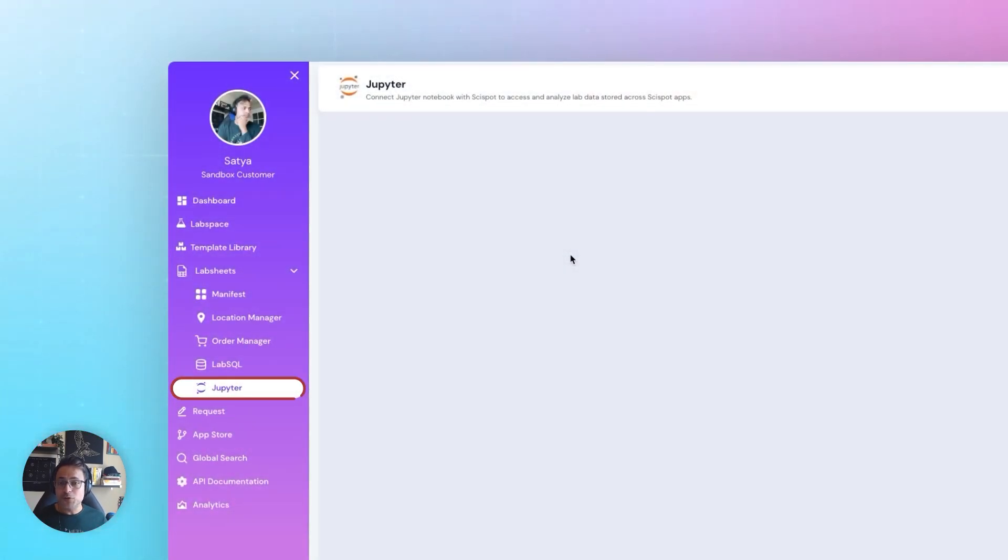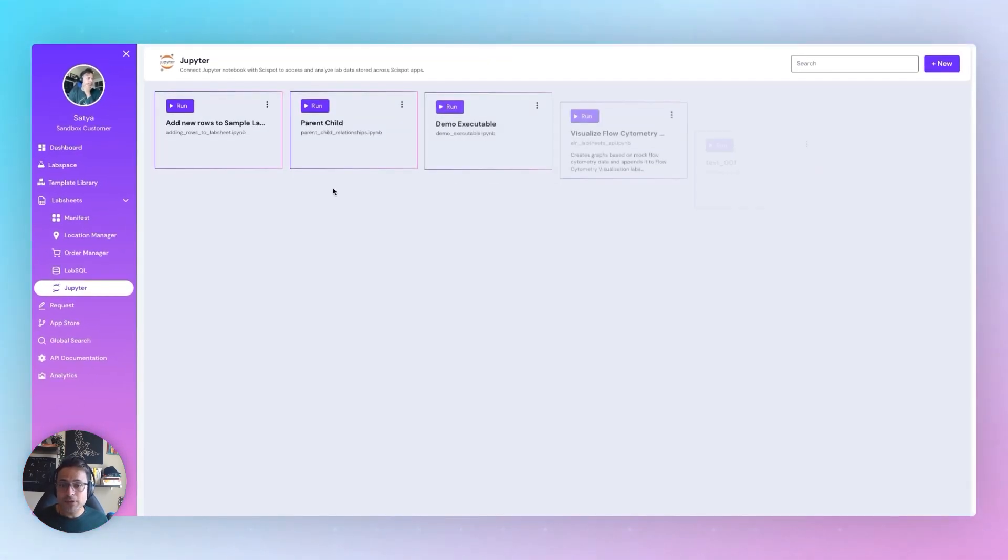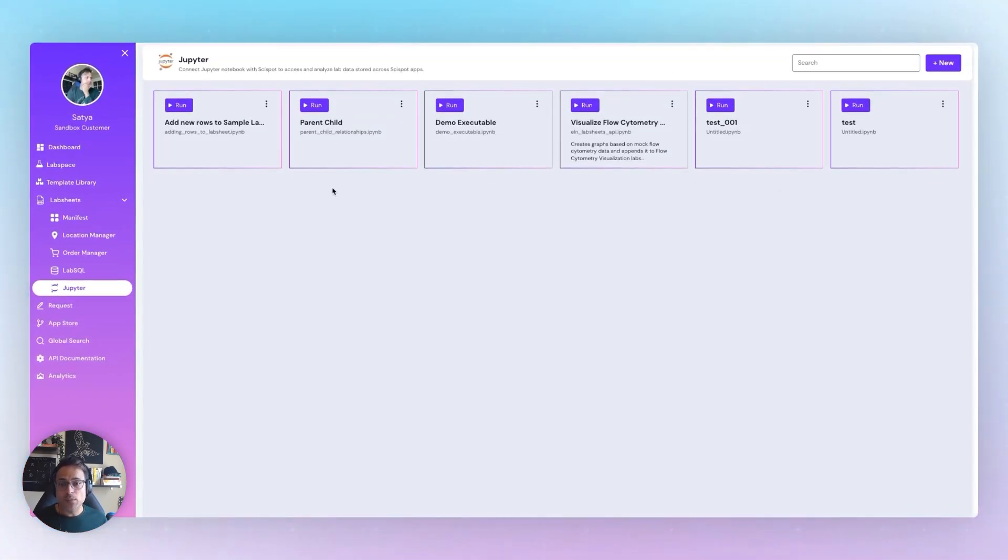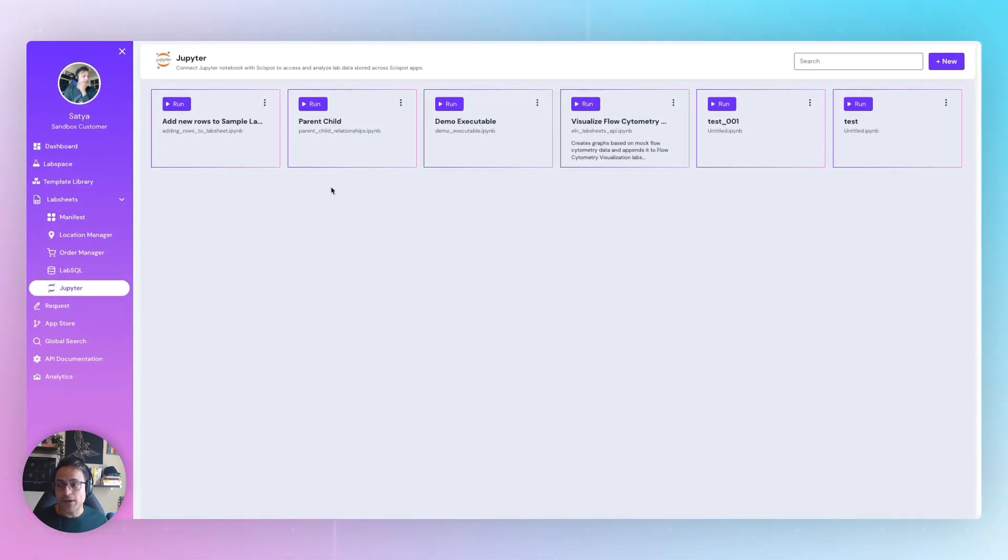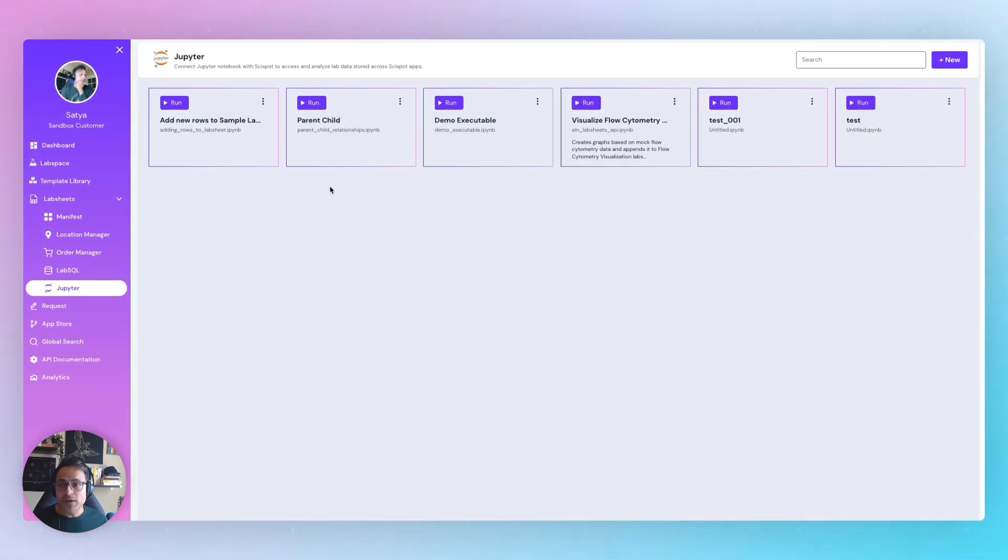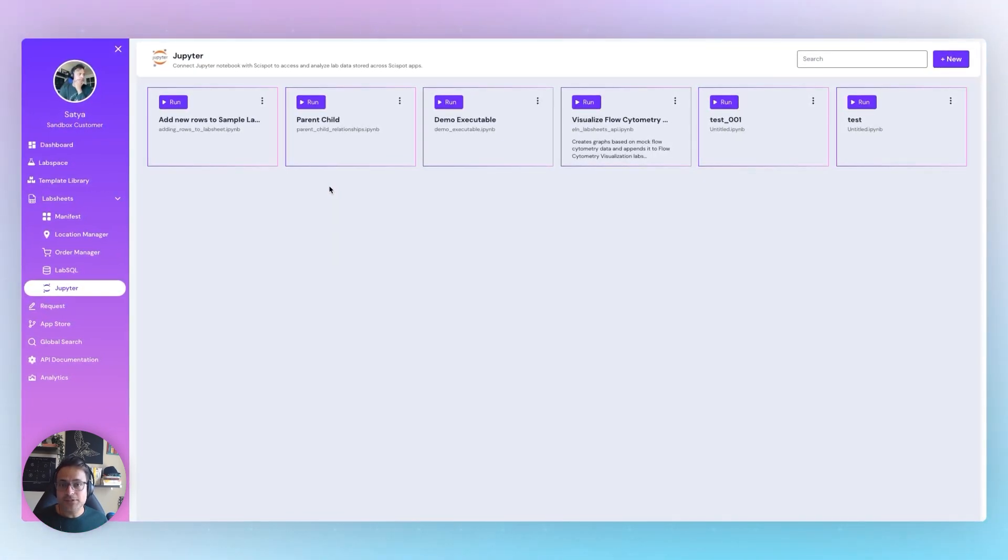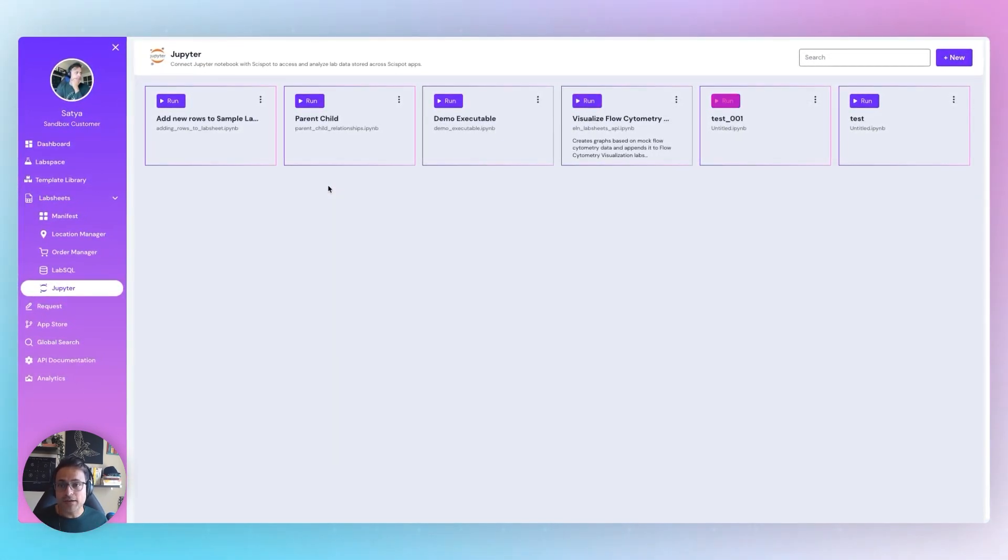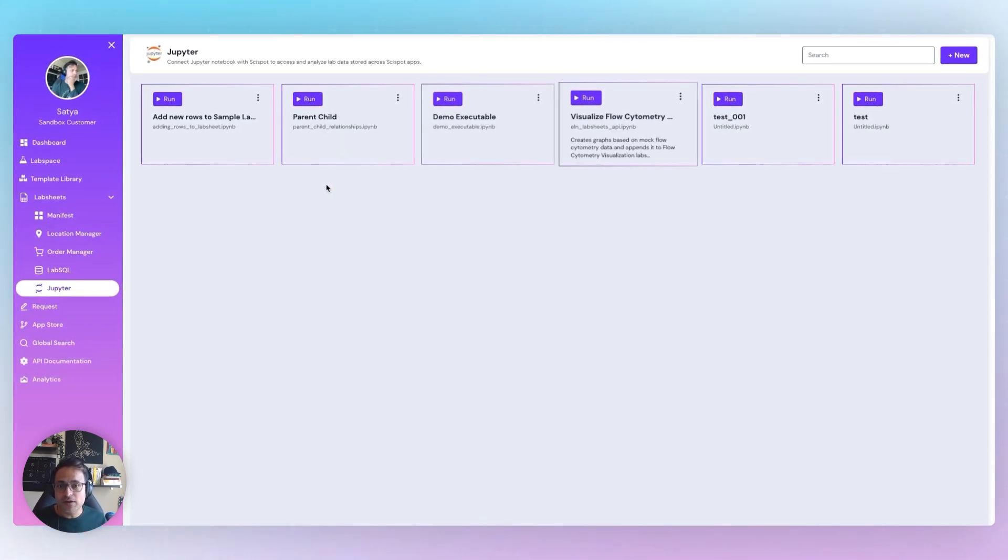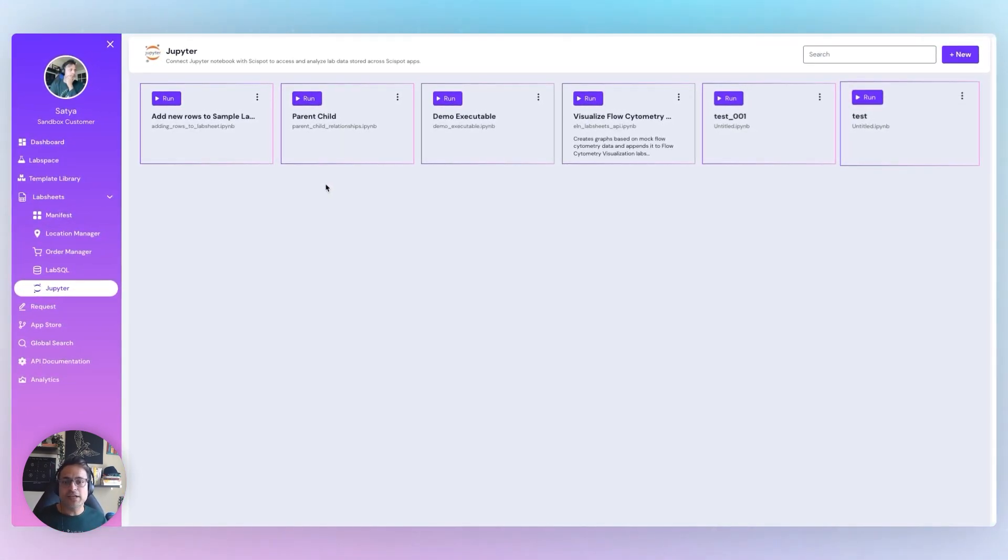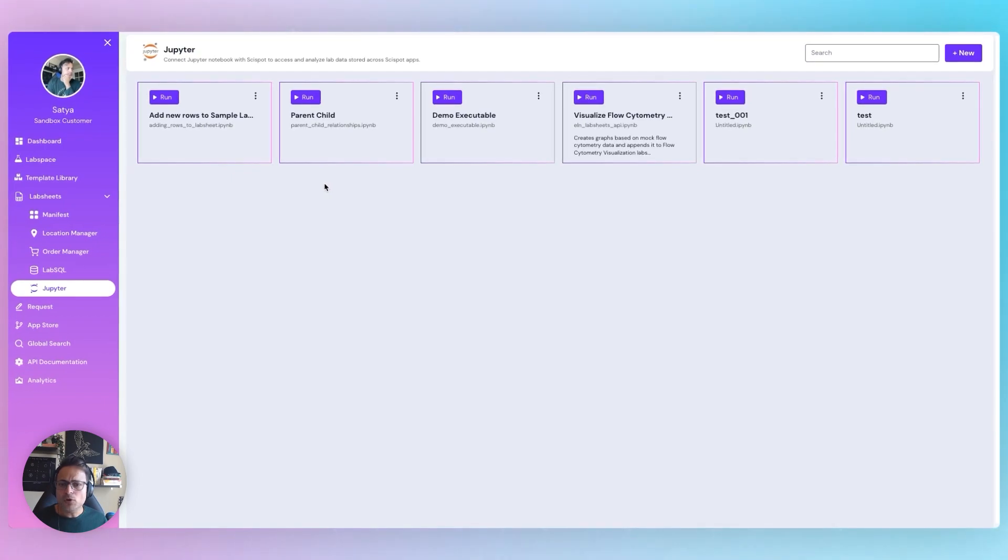And for those who love to code, our developer toolkit comes equipped with robust API and JupyterHub. With JupyterHub, you can write your own custom scripts and run them on SciSpot data without leaving the platform, whether that's preparing your standard curve or visualizing your flow cytometry data.